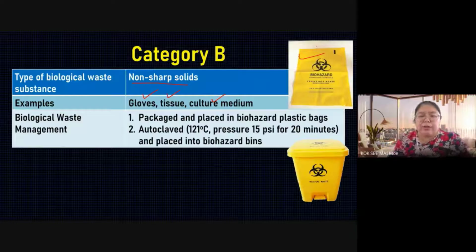So after doing it, you pack. After that, you put it inside this plastic. After that, you throw. This one is one of category B for waste management. After doing the test, would they want to keep it? Keep it for what? The virus is there, is it? So we need to throw. From here, they say pack and place into the biohazard plastic bag. So this is the first way. You can straightforwardly put it inside the bag.